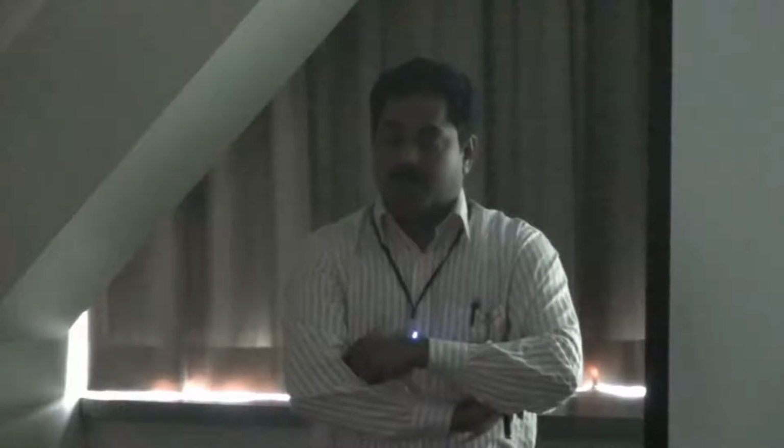So today I would like to talk about the structured illumination super resolution system produced by Zeiss. Although there are a couple of companies making this system, in this university right now we have an OMX system in molecular and cellular biology at the CLSL building, with Professor Belmont in charge of that system.